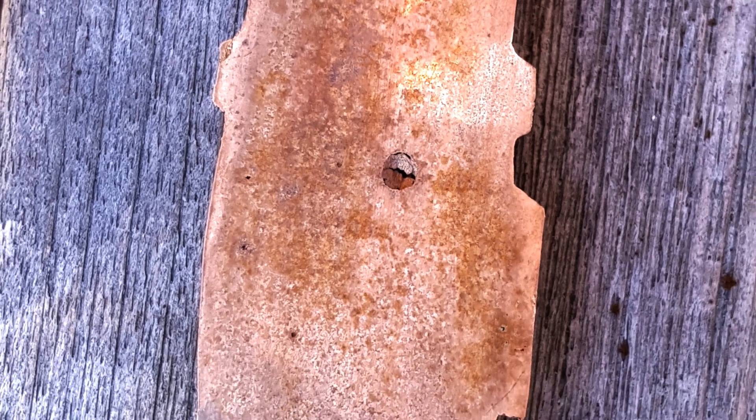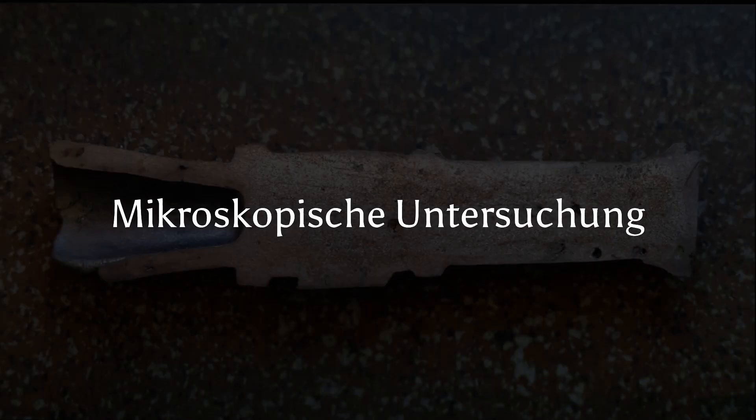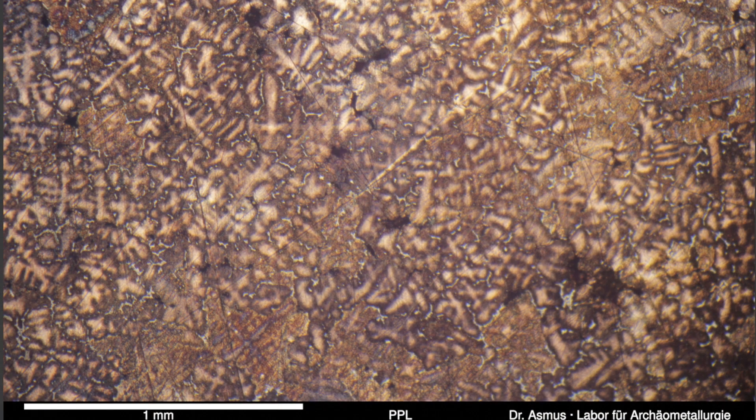Cavities develop if there is not enough liquid metal during solidification - that is, the ingate was dimensioned improperly. After we have identified the first casting defects, let's look a little bit closer into the material.